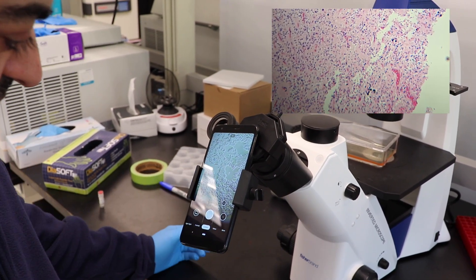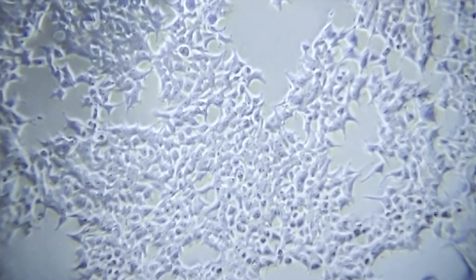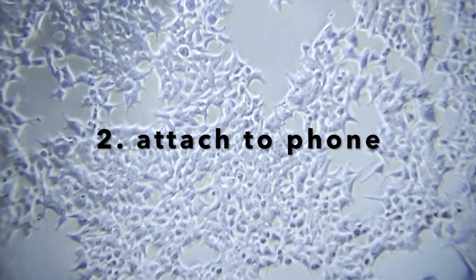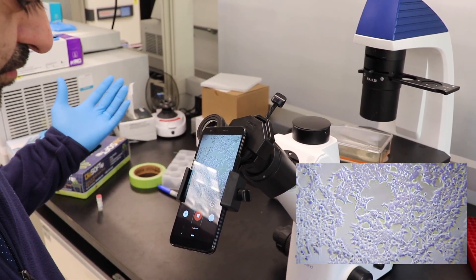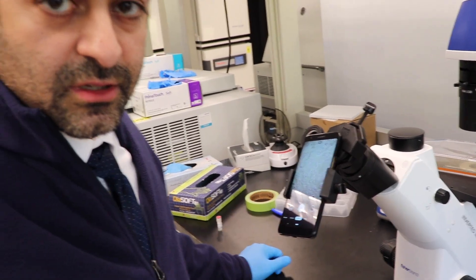These are nice cells. If I wanted to record a video, I can just do it like that. This is really the power of this little gadget — you've now turned a very simple microscope into a digital recording device. Easy as one, two, three: attach it to the microscope, attach it to your phone, and you're off to the races. A great way to share what's happening in the lab on social media or capture photos for your journals.